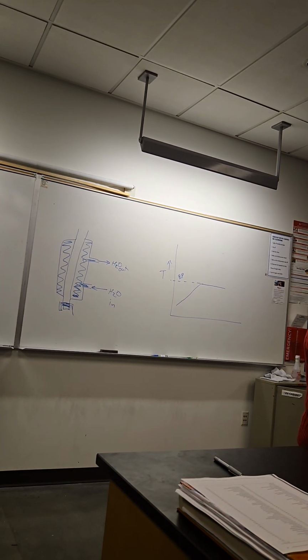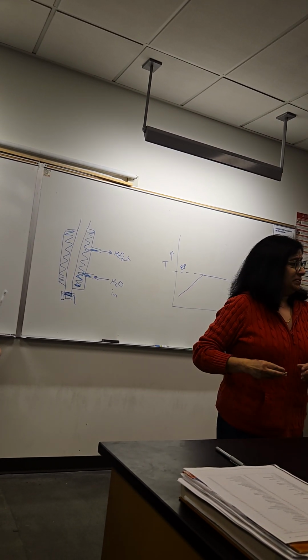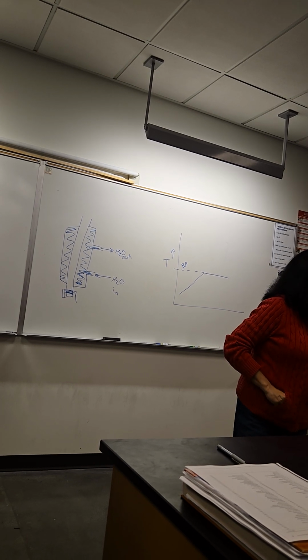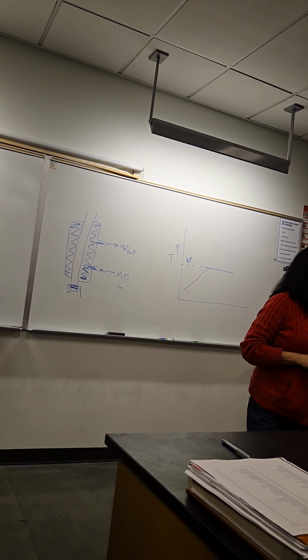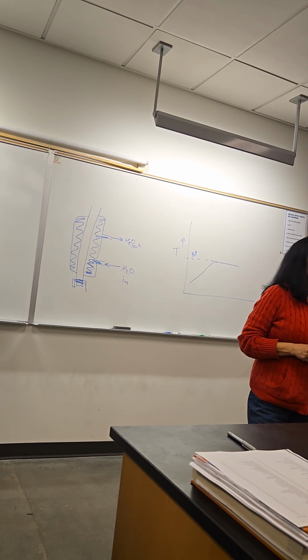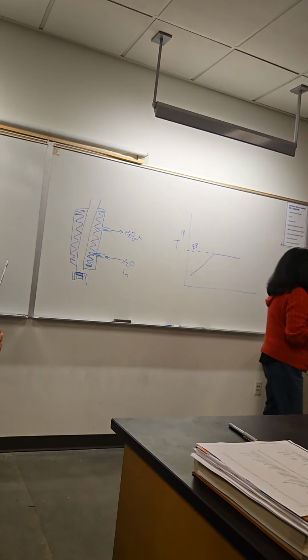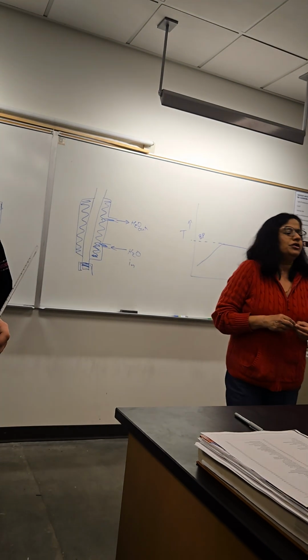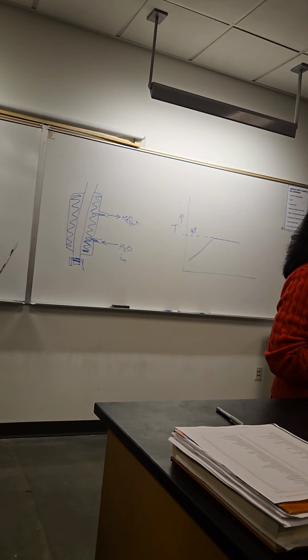The textbook said if the temperature begins to level off at a low temperature, then the liquid might be high boiling and the sample was not heated strongly enough. Is that a concern in this or no? Hopefully not. Because all of our liquids, yeah, some of them have higher-ish boiling points, but I don't encounter that problem. So we should be okay.